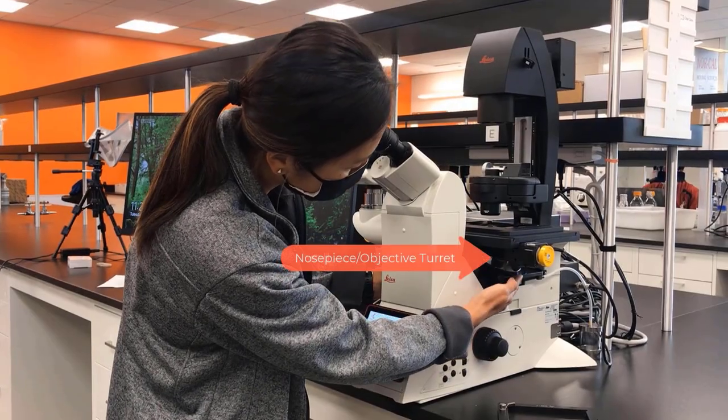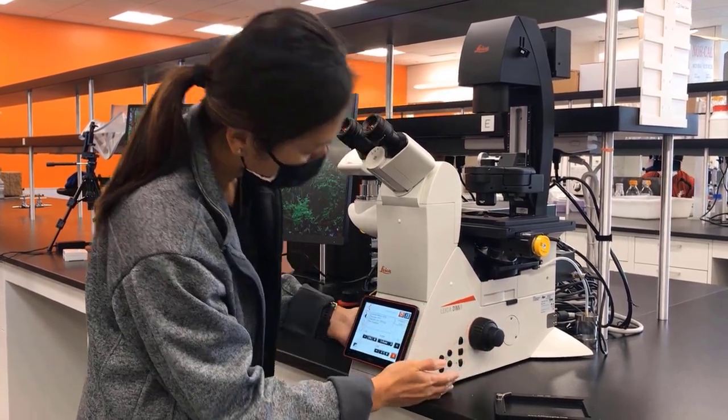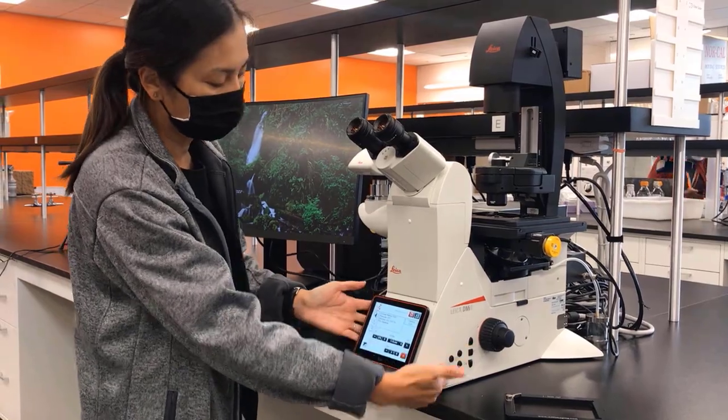Then we have the nosepiece objective turret, the filter cube turret, and the focus knobs. Then we have these buttons on either side of the microscope that are programmable.